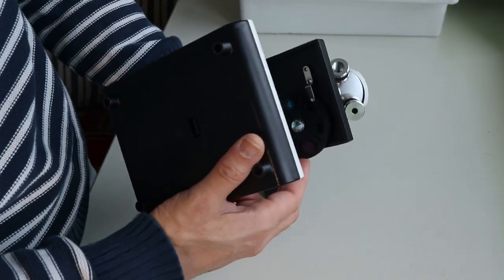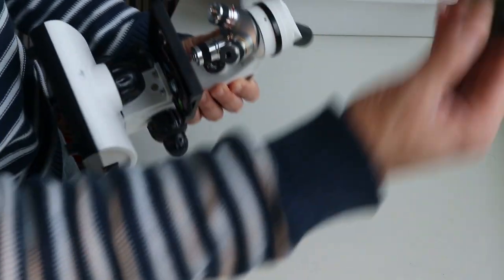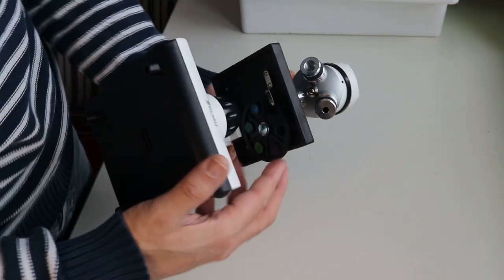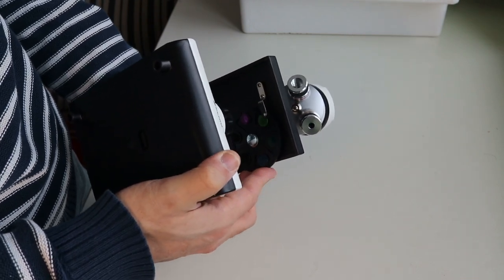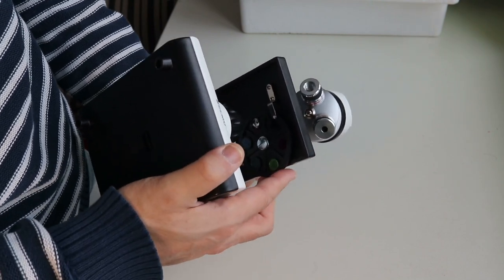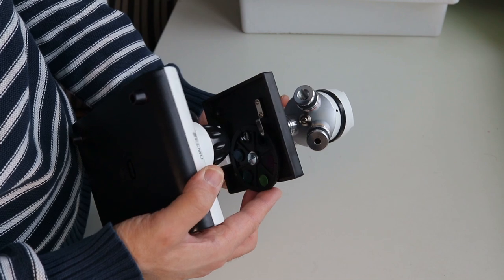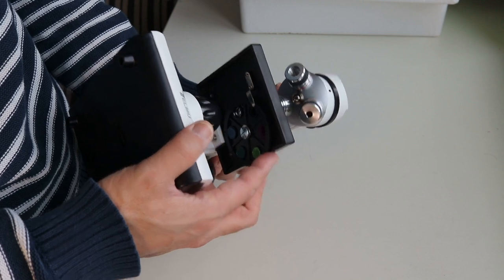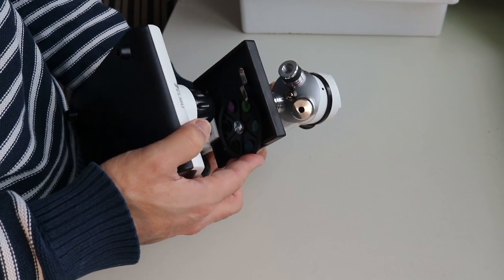On the bottom here, we have a disc with different filters. I dropped the eyepiece. Never forget to remove the eyepiece. This ring down here, I don't really get the point of it, because it's just some plastic filters which kind of just change the color of the appearance. It's not a real condenser, obviously, okay? But I don't really see the purpose of this. I guess it just is there to keep the children a little bit busy changing the colors around.